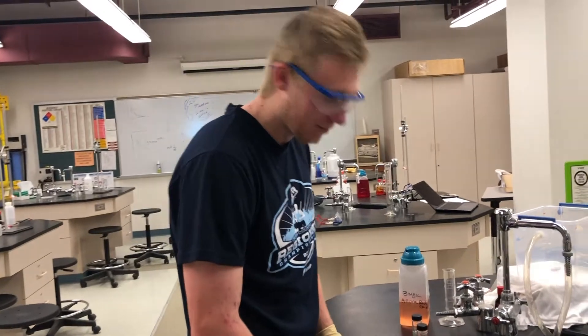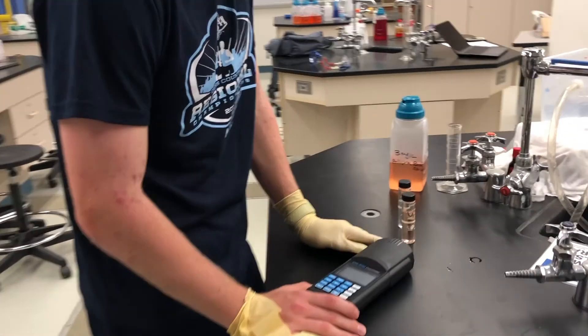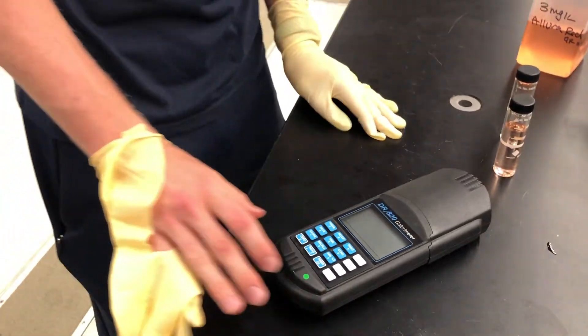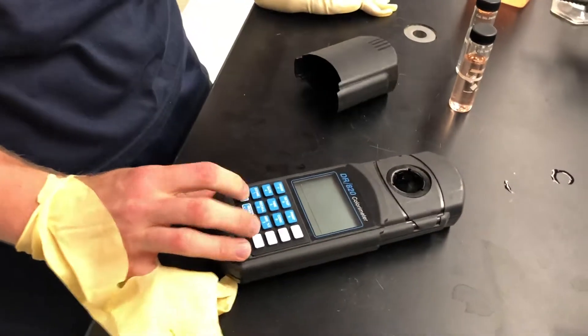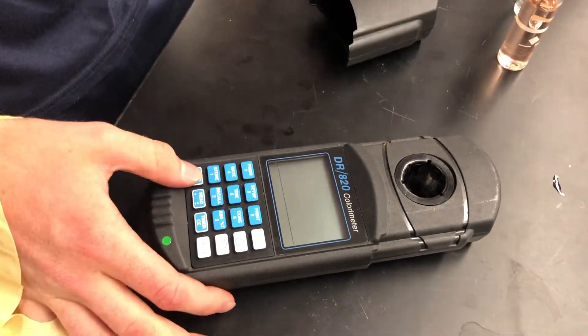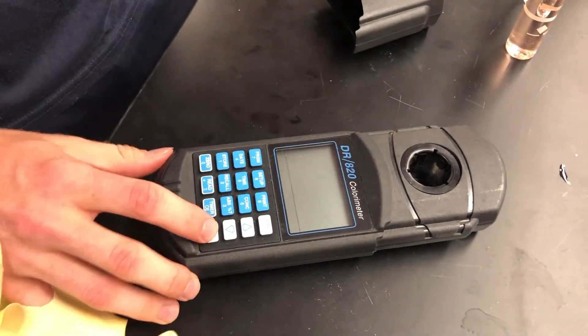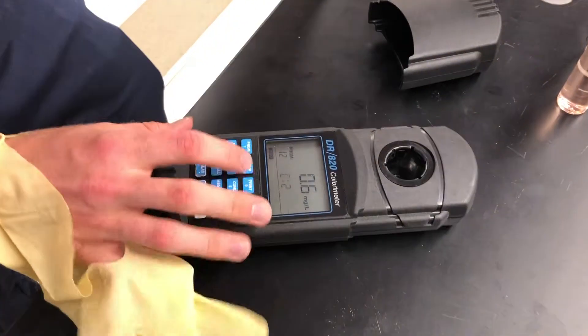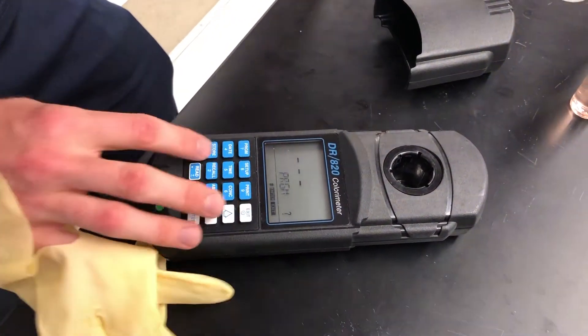So here we have the Hatch Meter. We use this to measure the absorbance for the data. So here we remove this, and we're going to turn it on. There we go. Okay. Here we go. And so we have to go to program 12.